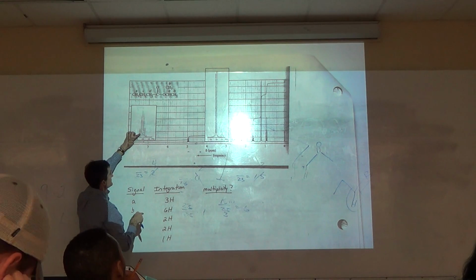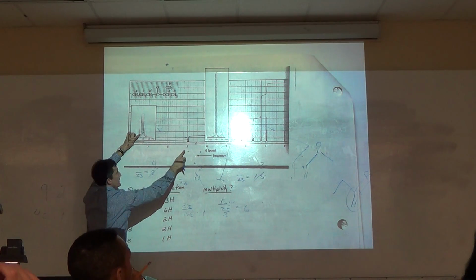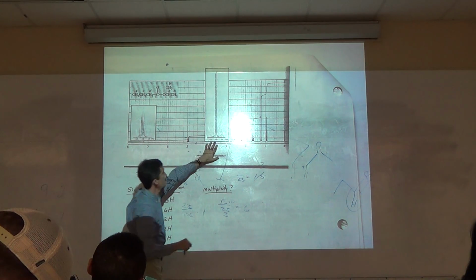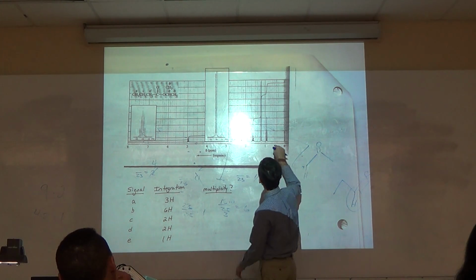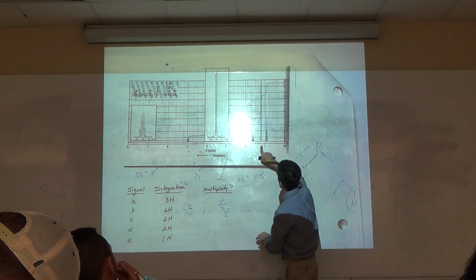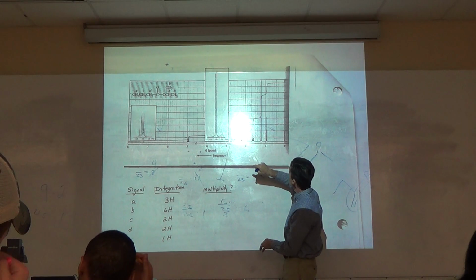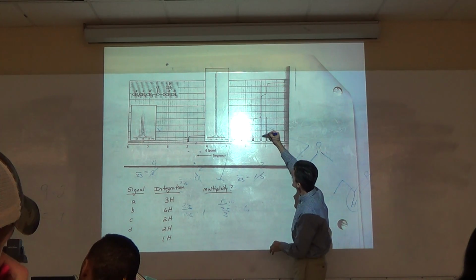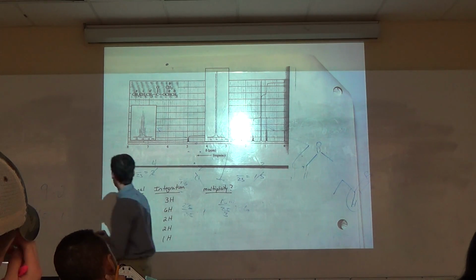What is this? That's where they're blowing up this signal so you can see it better. What is this? Look at that baseline. 1.1. That's where they're blowing up that signal there at 1.1 so you can see it. The reason is you can see it's a doublet, where here it almost looks like it's just a singlet. So you can see the multiplicity better.